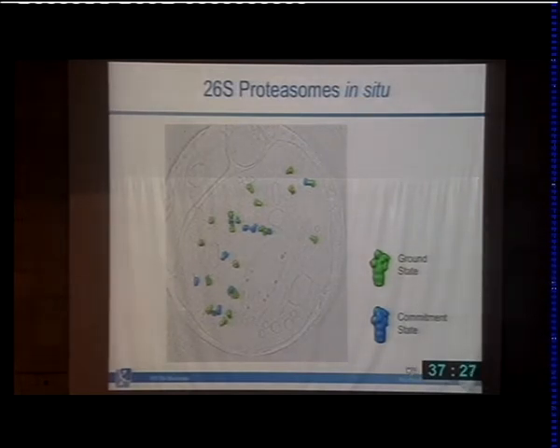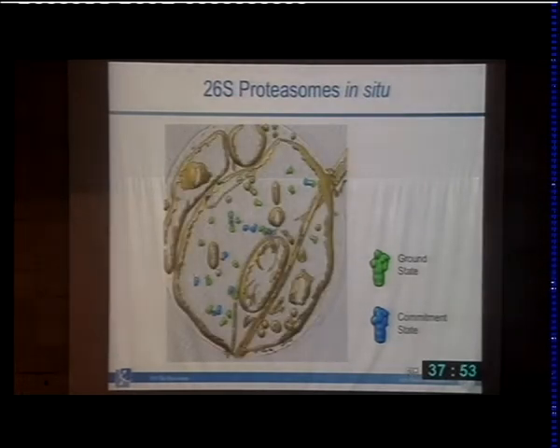So the challenge for the future is quite obviously that we work out interesting information out of the correlation of positional information and the state of activity, which requires that we scan and examine very large molecular cellular landscapes, which can be done quite systematically, and I think also with the necessary speed in order to come up with some interesting results here.